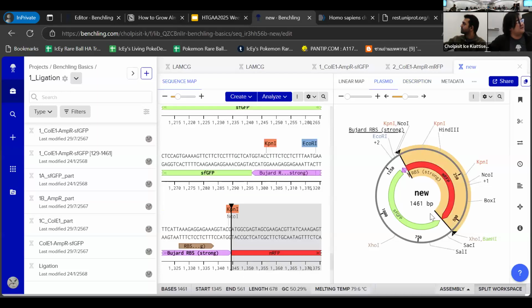Yeah, you see that this is an error that came up, it doesn't have a backbone. So maybe they have some other cut sites in there that leave the other side out. So this pair of enzymes is not workable.